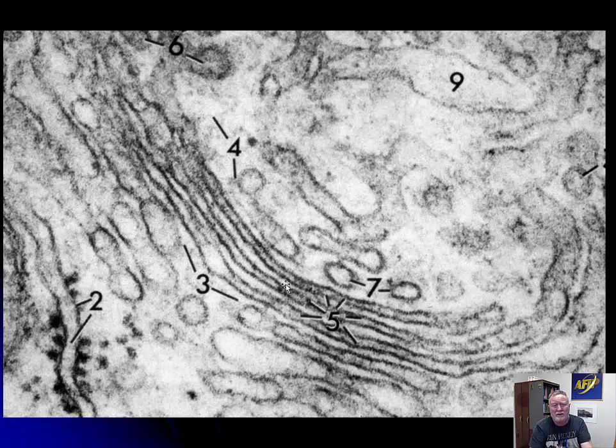Not that it really makes any difference, because if we were a little farther away, you would be able to tell that. In certain cells, they're very prominent. They're usually not terribly prominent. Certain cells, like plasma cells, form what's known as the hof. It's that cleared area in that sea of purple endoplasmic reticulum. And they're big, and they're busy, telling all the proteins, you're an antibody, you're going out of cells. But they probably have the most prominent and important Golgi of any cell in the body.